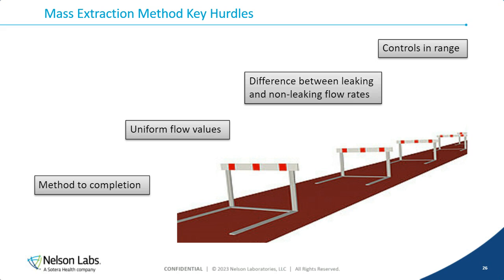And then my positive is going to be that same master part with the CLL on, so a simulated defect in the solid metal part. I need to make sure that the flow values for my positive and negative are going to be similar to the flow values for my samples and for my samples with the CLL, so that I know that I have a good comparison, and that the controls I'm using for testing are reflective of the right flow values for that particular setup.